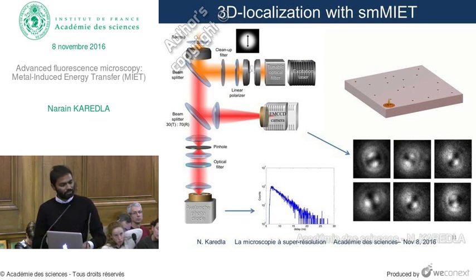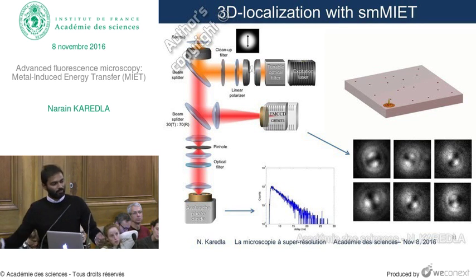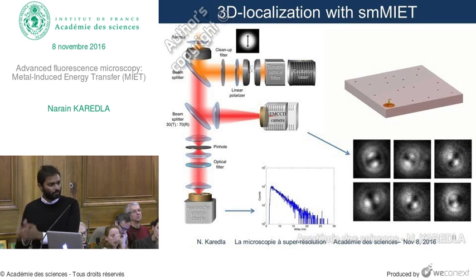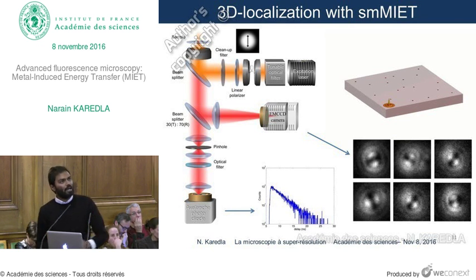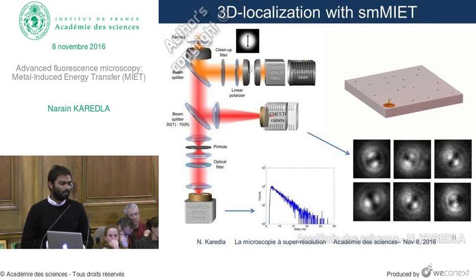Of course, when you have a point scanning system, you lose. You have a different state when you have reached the end of the cell. But these lifetime cameras in the future, for example, will give you a much better temporal average over the whole cell for the whole frame, the time duration that you expose to get the average height during this process. If you label enough, you can go down to 1 second or 5 second resolution.